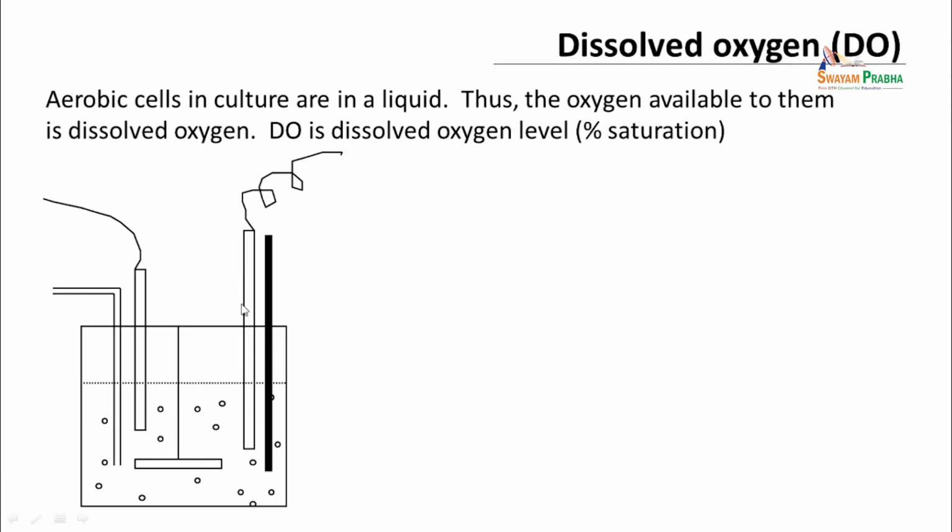So, this is the bioreactor here again. The schematic of it, the stirrer as we have seen earlier, the medium in which cells are growing, maybe the DO probe, pH probe, the air inlet, and a temperature probe. Let us choose a conceptual system. Our systems, as you know, could be either real or conceptual. In this case, we are going to choose a conceptual system. Why we are choosing such a system would become a little clearer later. Most likely I will point that out.